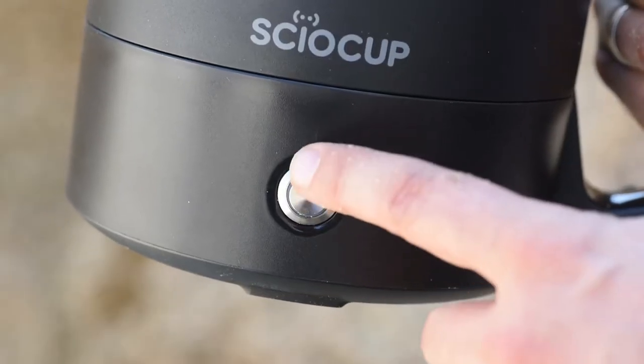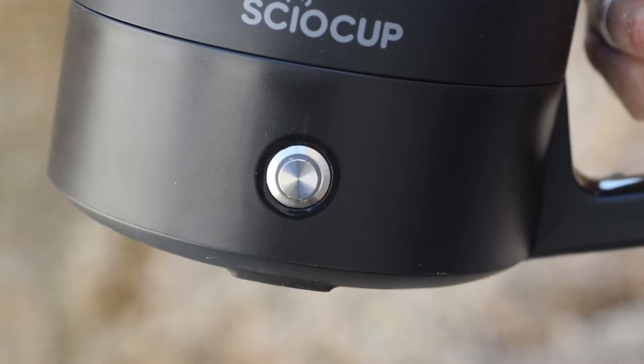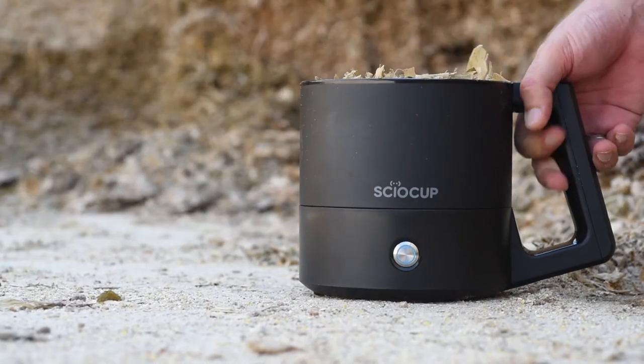Turn on Siocup by pressing the button for 2 seconds, and place it on the ground or other solid and steady surface.